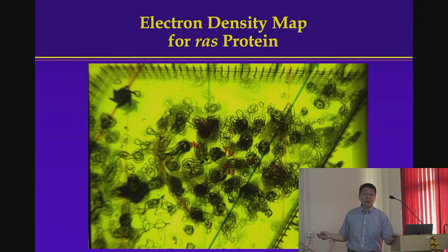The next part is you have to interpret the electron density you see here based on your protein. It tells you your protein is here, tells you nothing else. Doesn't tell you where the N terminus of the protein is, doesn't tell you where the C terminus is, doesn't tell you where residue tyrosine 31 is. You have to go in and interpret it manually. It used to be manual. Now, again, you can do it automatically. So the first thing we look for is secondary structures. What are the secondary structures in the protein? Alpha helices, beta strands. So you look for those.